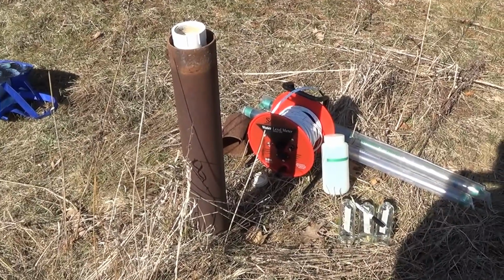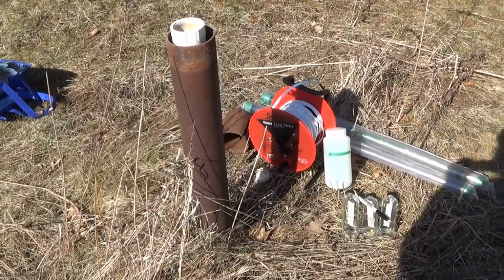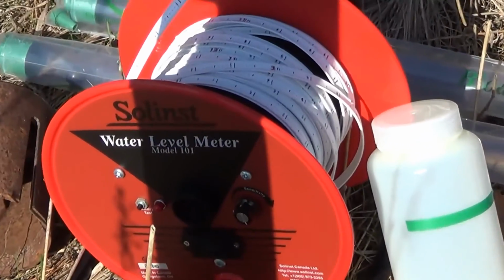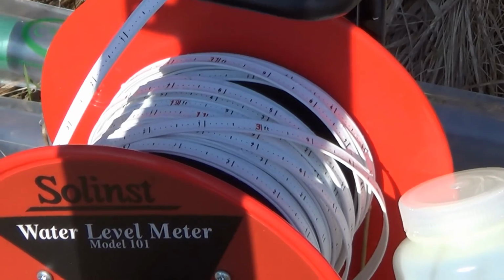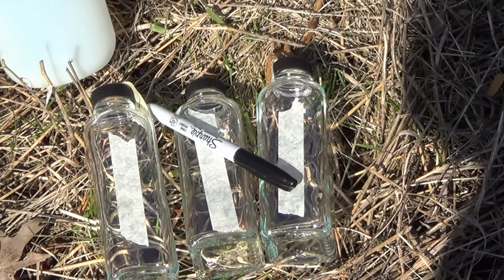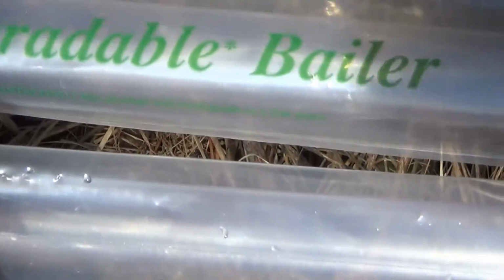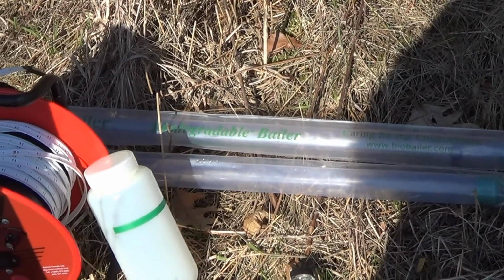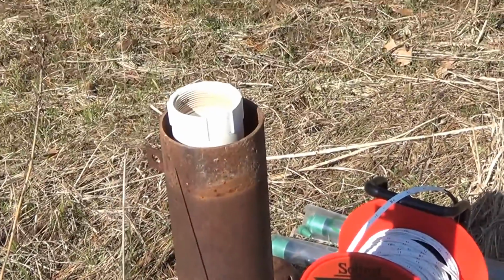We are getting ready to test the well water in this well here at UW Green Bay. And so we are getting our equipment ready. We have a water level meter here that measures the depth of the well. We have our sample bottles, and we have some sterilized bottles here so we can do some E. coli testing. And we have these disposable balers here. There are about 1 liter in each of those. So we're going to get ready.